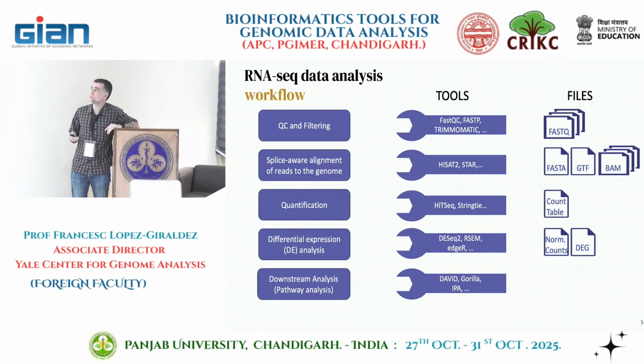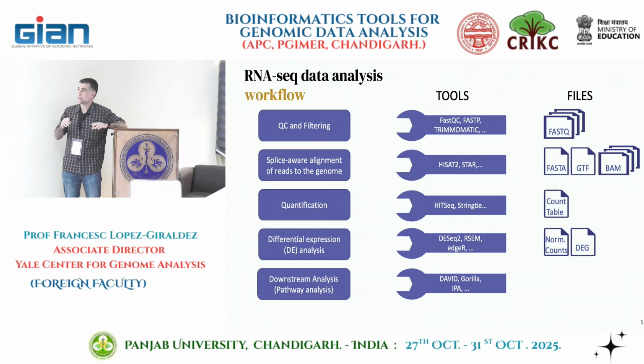But again, our steps are going to be, today, the QC and filtering, where we're going to use FastQC and fastp. We align with HISAT2. We're going to use StringTie to get the table. And tomorrow we're going to use DESeq2, and we'll see what happens with the pathway analysis depending on time.